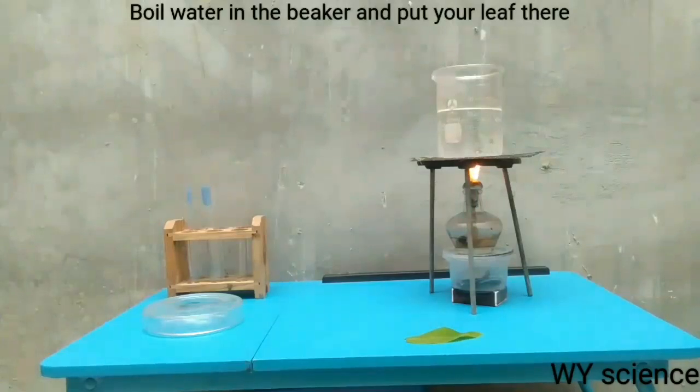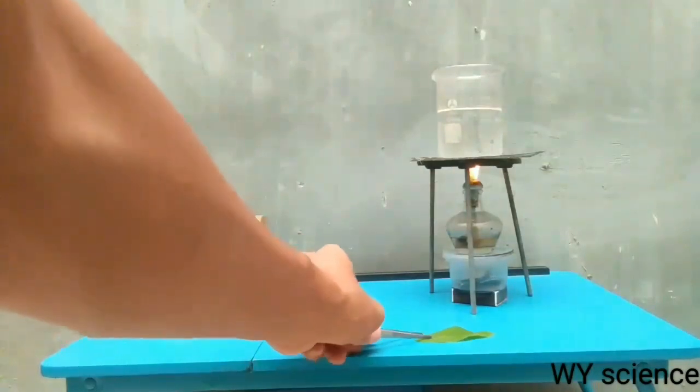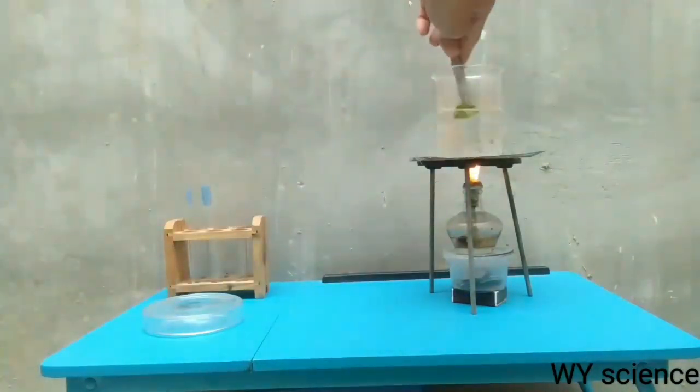The first thing to do is to boil a certain amount of water and then put your leaf in there for a few minutes, like this.